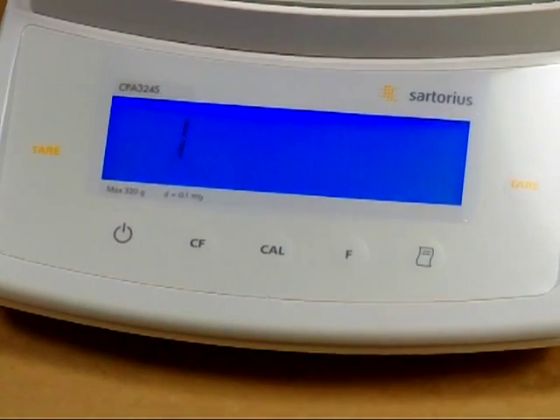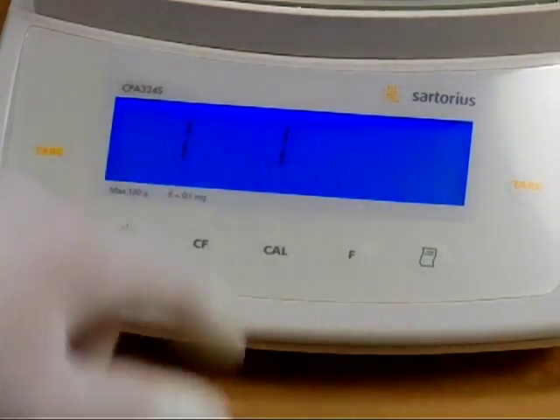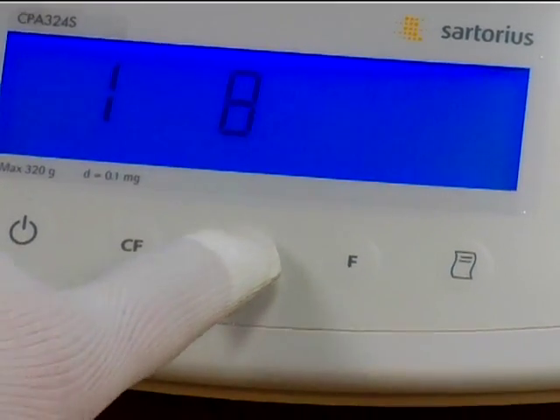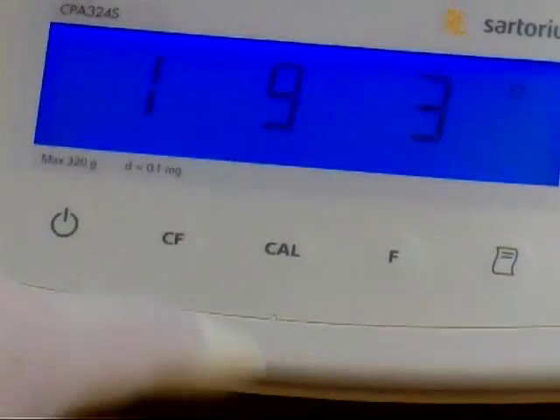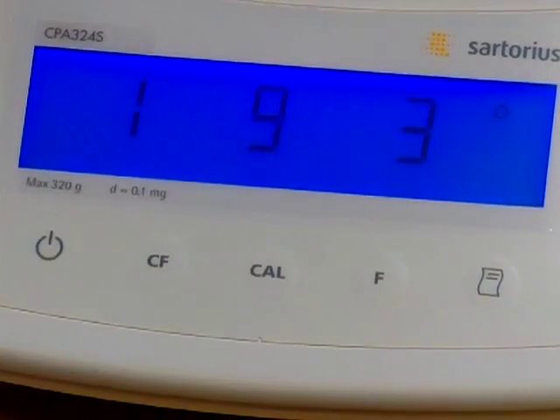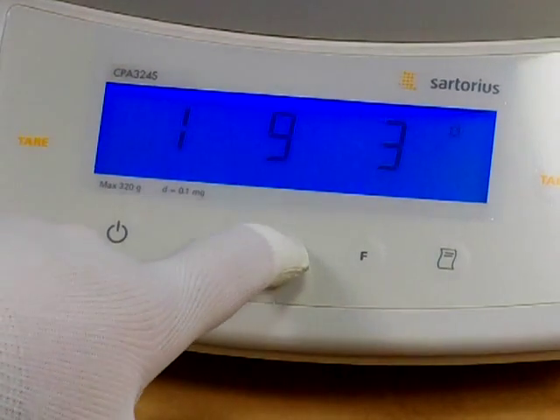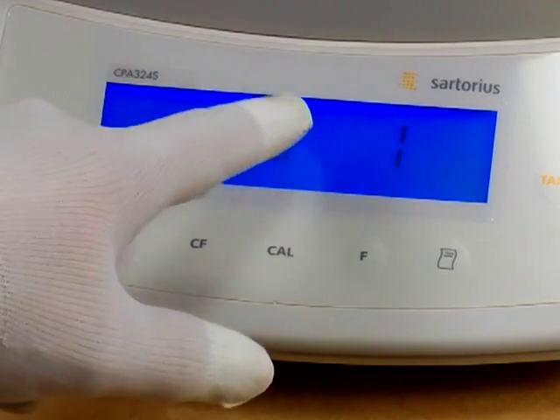To do this, we press the print key to move the cursor to the right. We need to change the last digit to a nine, so we press the Cal key to increment up. We now have 191. The default is 193 — we know that's what the balance is set to because there's a circle in the top right-hand corner. We need to change this value.